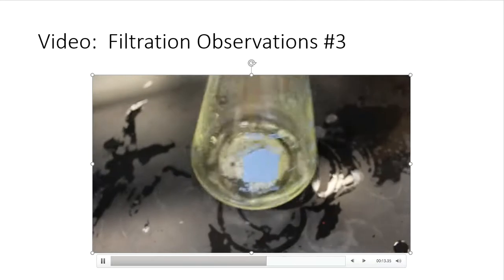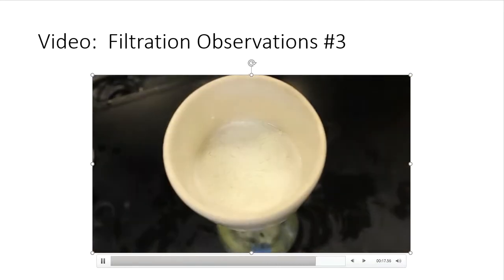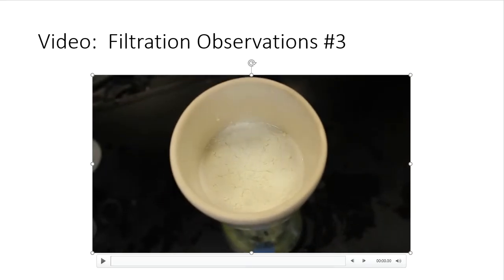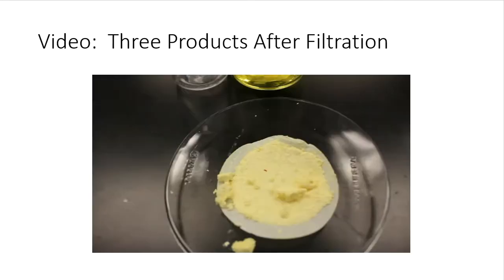So you can still see a slight tinge of yellowish. I mean, almost urine color. I hate to say that, but it's almost like urine color in the flask. Well, if you're hydrated enough, it's urine color. If you're not hydrated, then it's going to be brown and nasty, like the very first 1 or 2 steps of the lab.